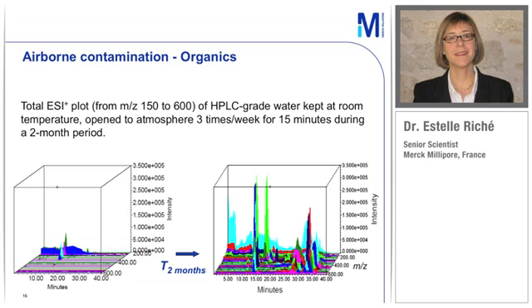So usually the recommendation I would have if you do organic analysis, HPLC, UHPLC, or LCMS, I would recommend you use freshly purified water every day. So every morning discard whatever is left of the water from the day before and get freshly purified water. That way you can really be sure your results will be the best.